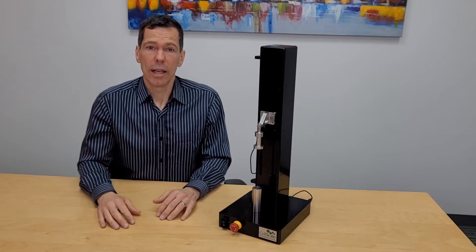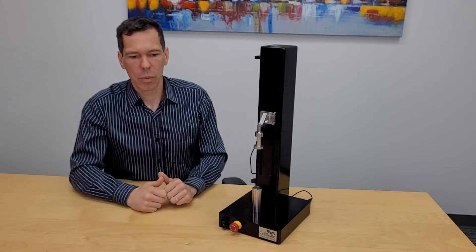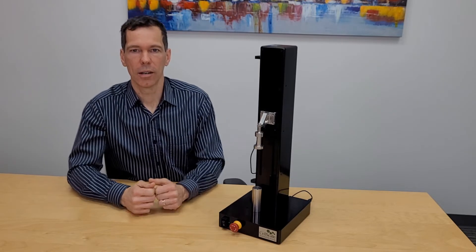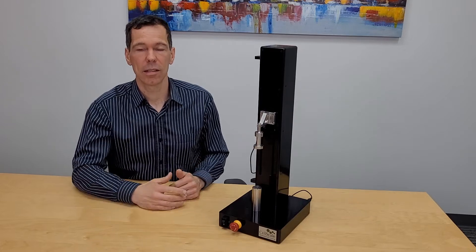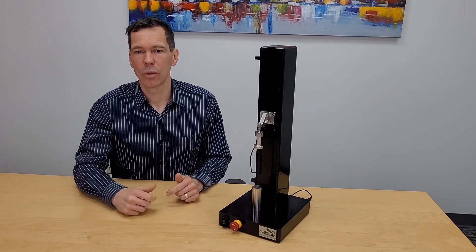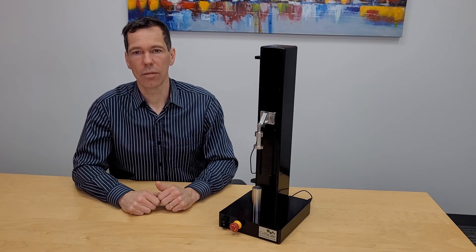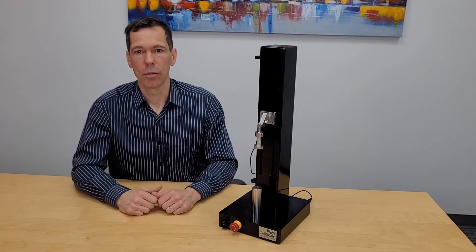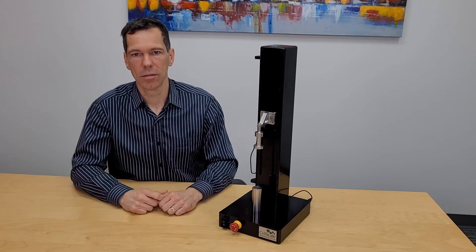So what I'm going to do in this video is go through kind of a quick change where I'll show the different formats, the different types of tests that the system's capable of. And then at the end, I'll run through a tension test to see the software and how the software enables the users to run a wide variety of different tests.